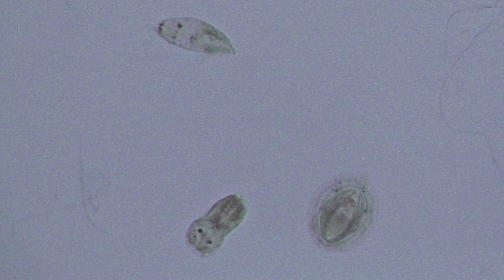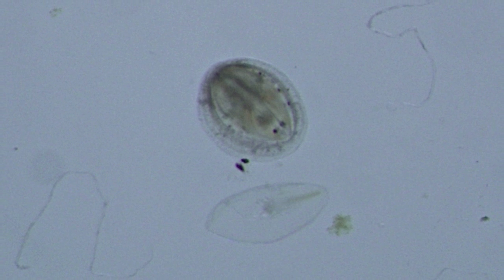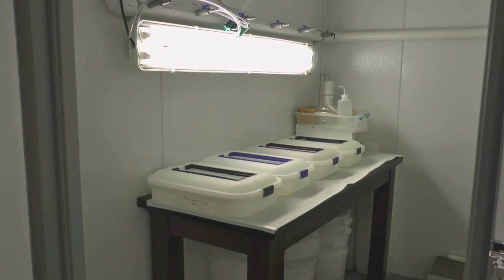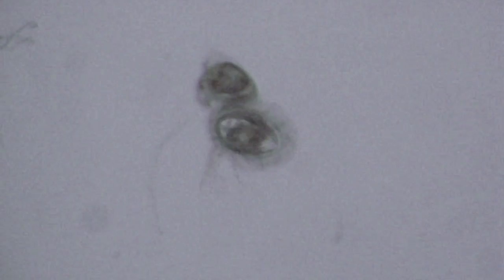Here you can see the cyprid ready to molt, and the young barnacle. Next to this young barnacle you can see its molt, and those little black dots were its eyes. These panels stay in the incubator at 28 degrees Celsius for 2 to 3 days or until almost all of the cyprids have settled, just like this one.